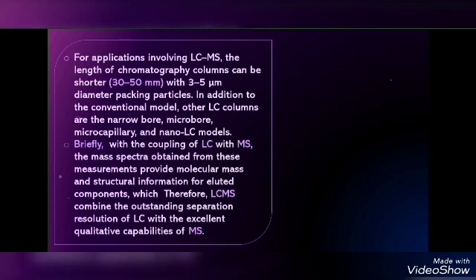Briefly, with the coupling of LC with MS, the mass spectra obtained from these measurements provide molecular mass and structure information for eluted components. Therefore, LC-MS combines the outstanding separation resolution of LC with the excellent qualitative capabilities of MS.